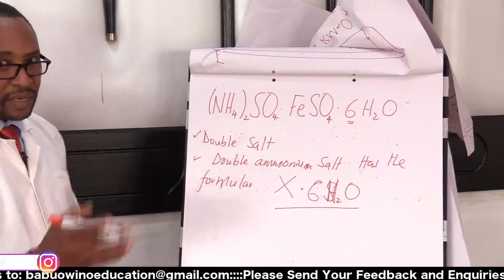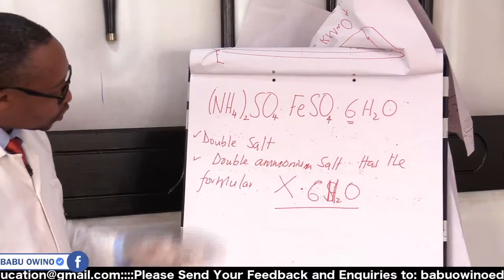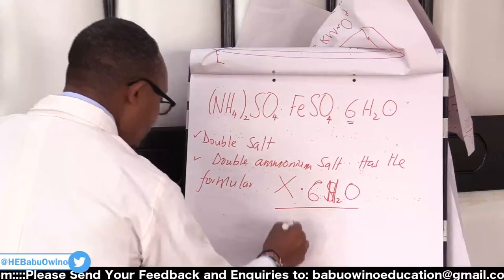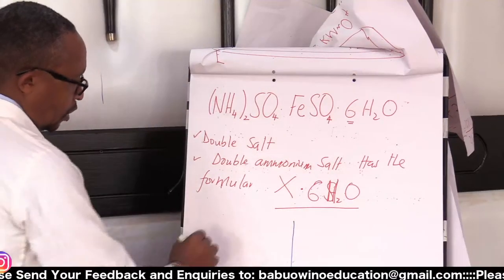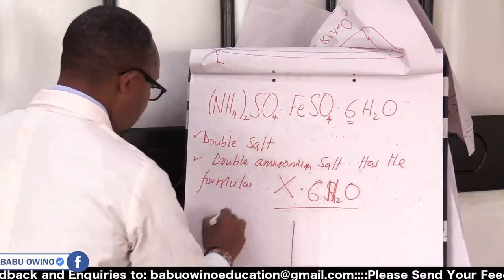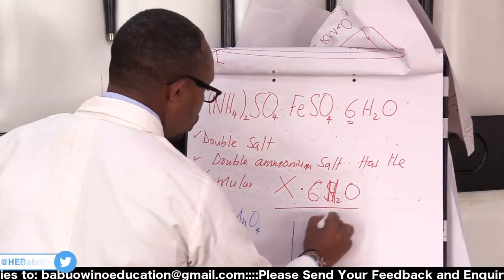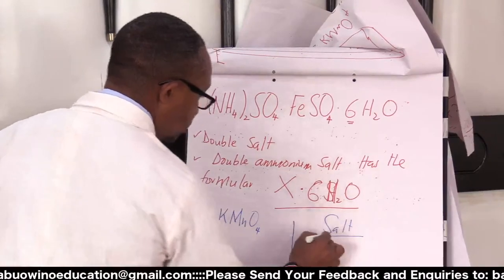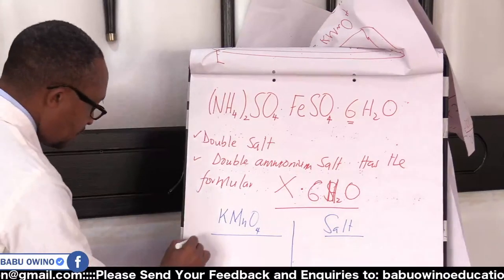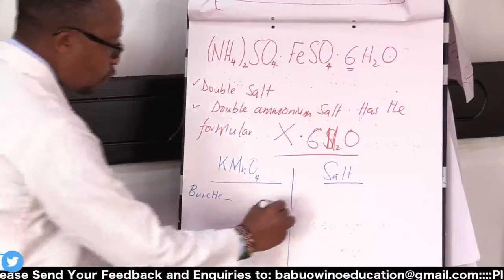So the examiner really doesn't care whether you know the salt or not. And again, you don't have to know the salt. So what does that one mean? That one means that you still have to do the same. You have your ammonium salt, it's combining with the permanganate. So you have your permanganate here, and you have your salt. The same process. Here you have what is in the burette. You have what is in the pipette.